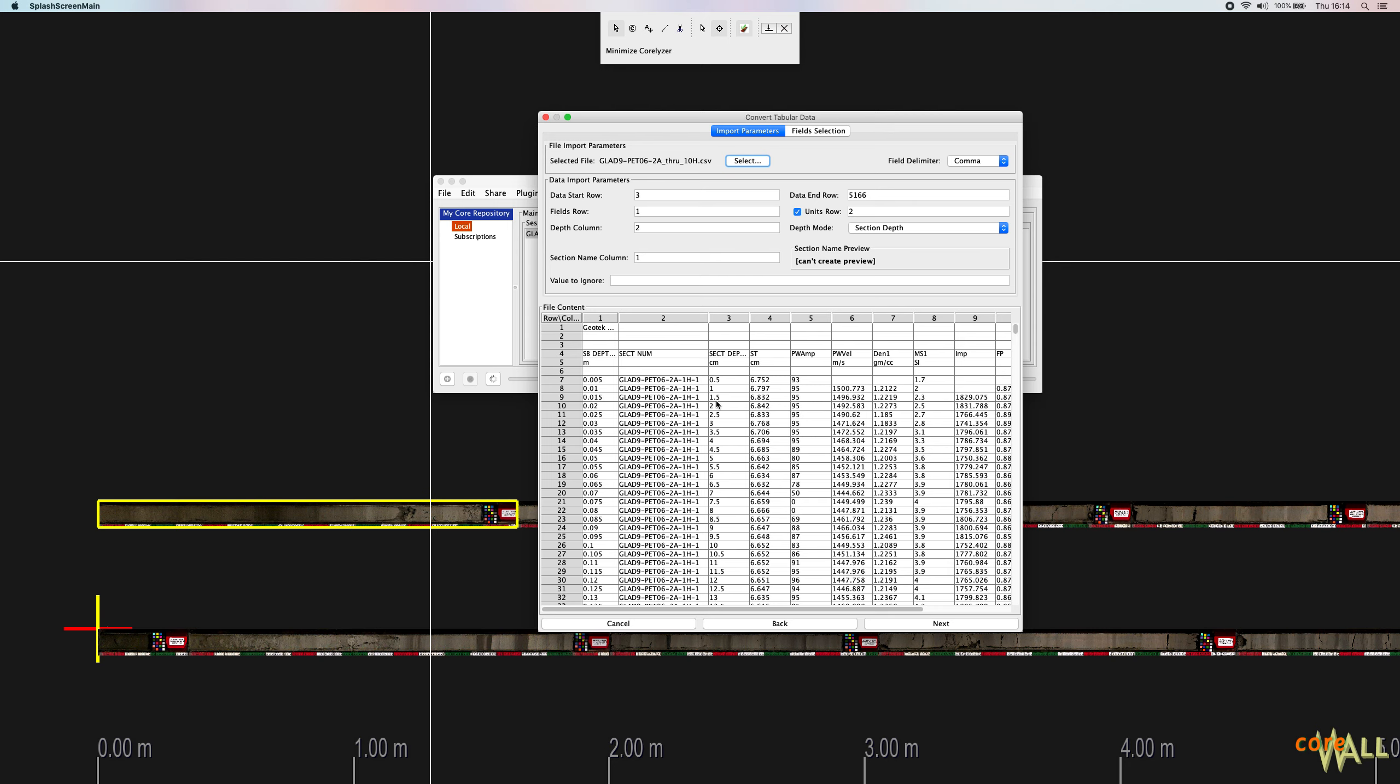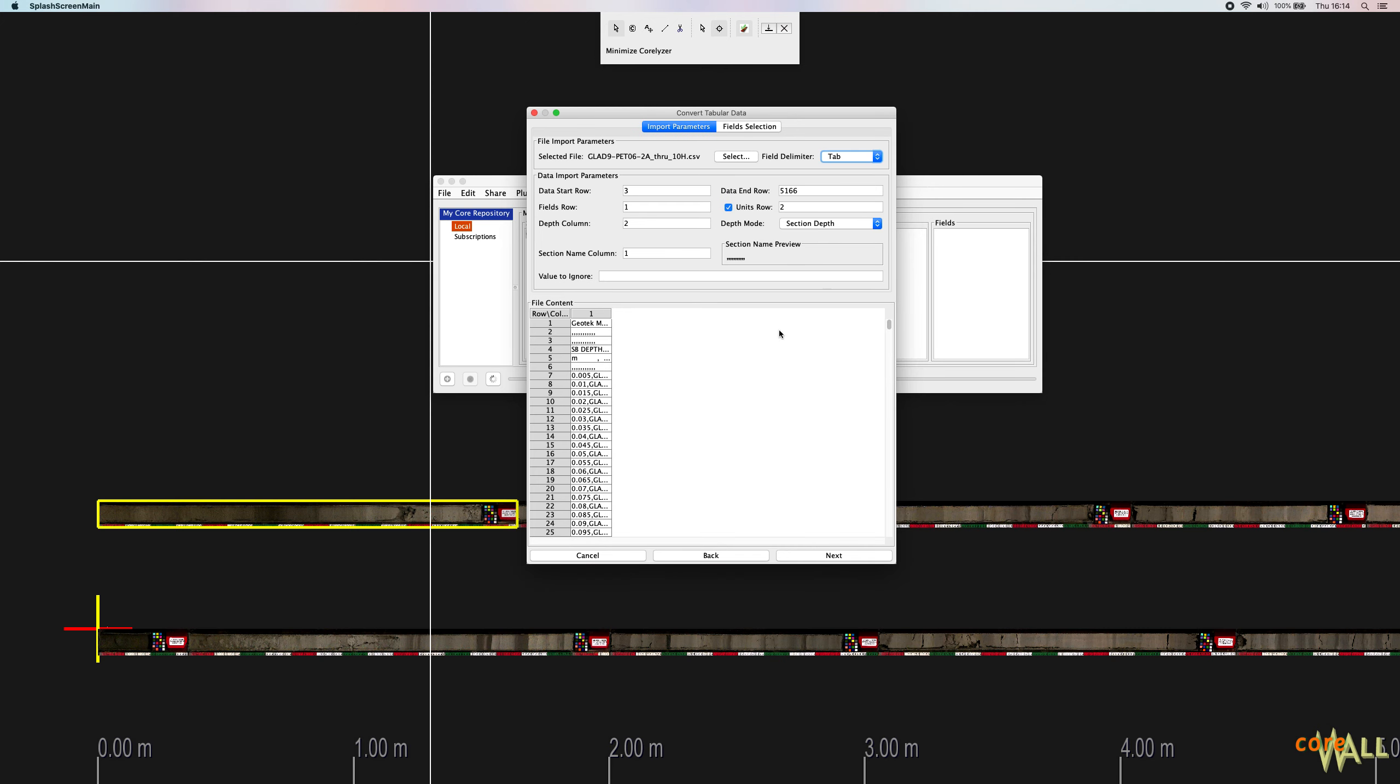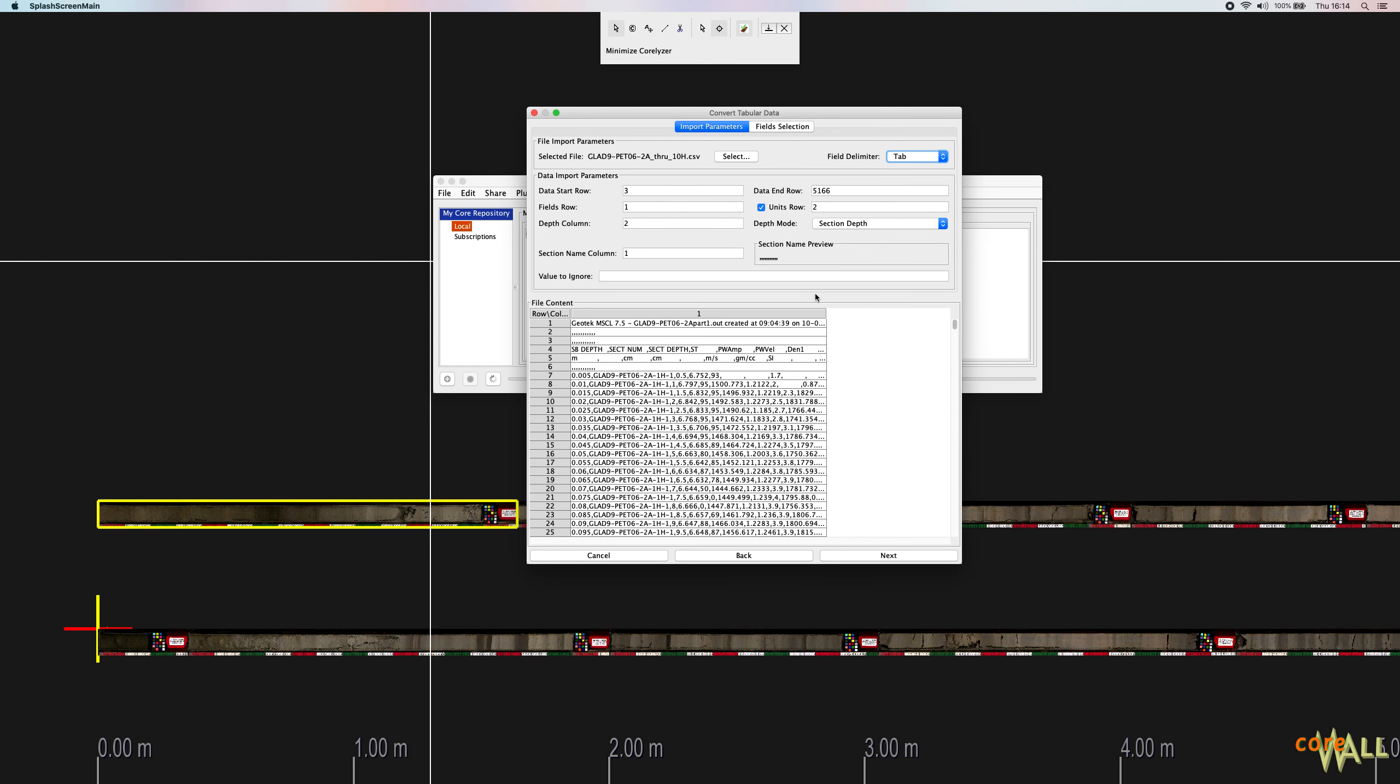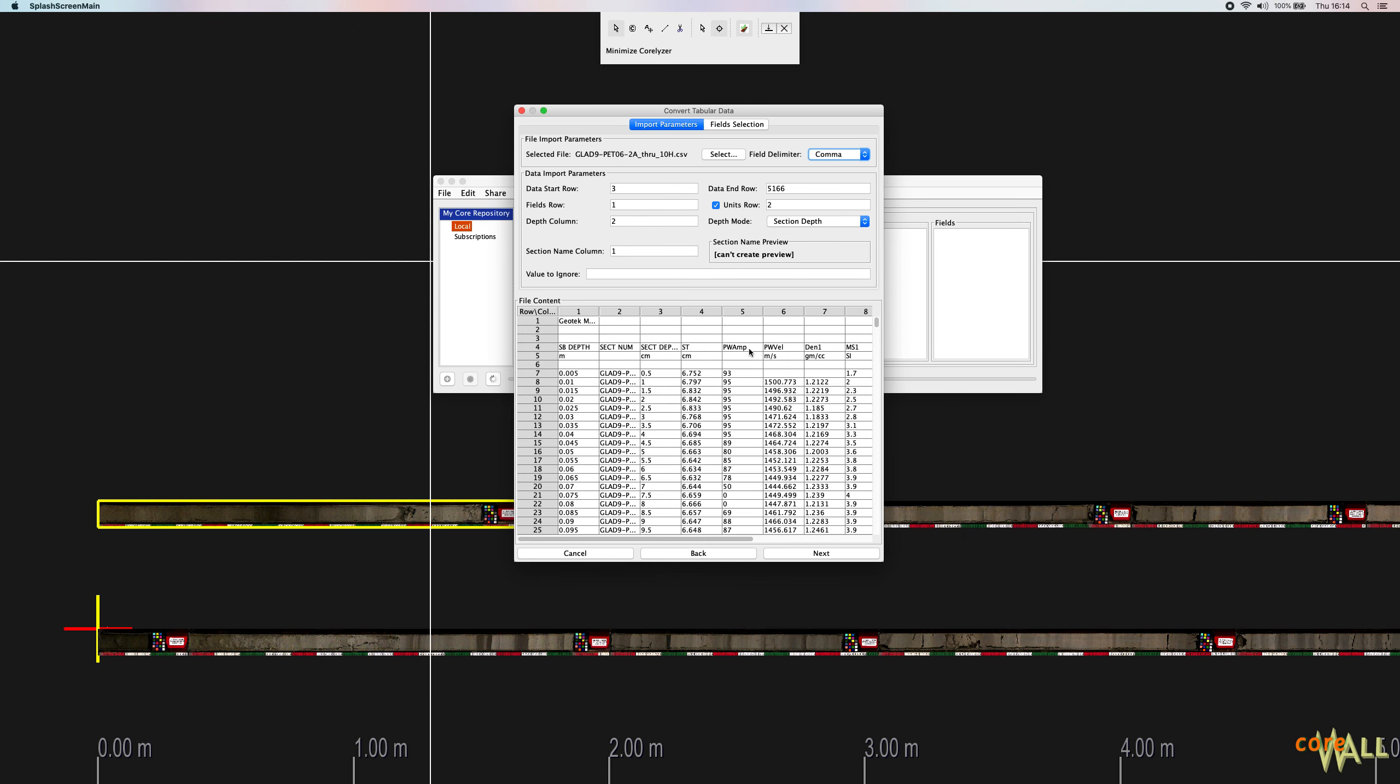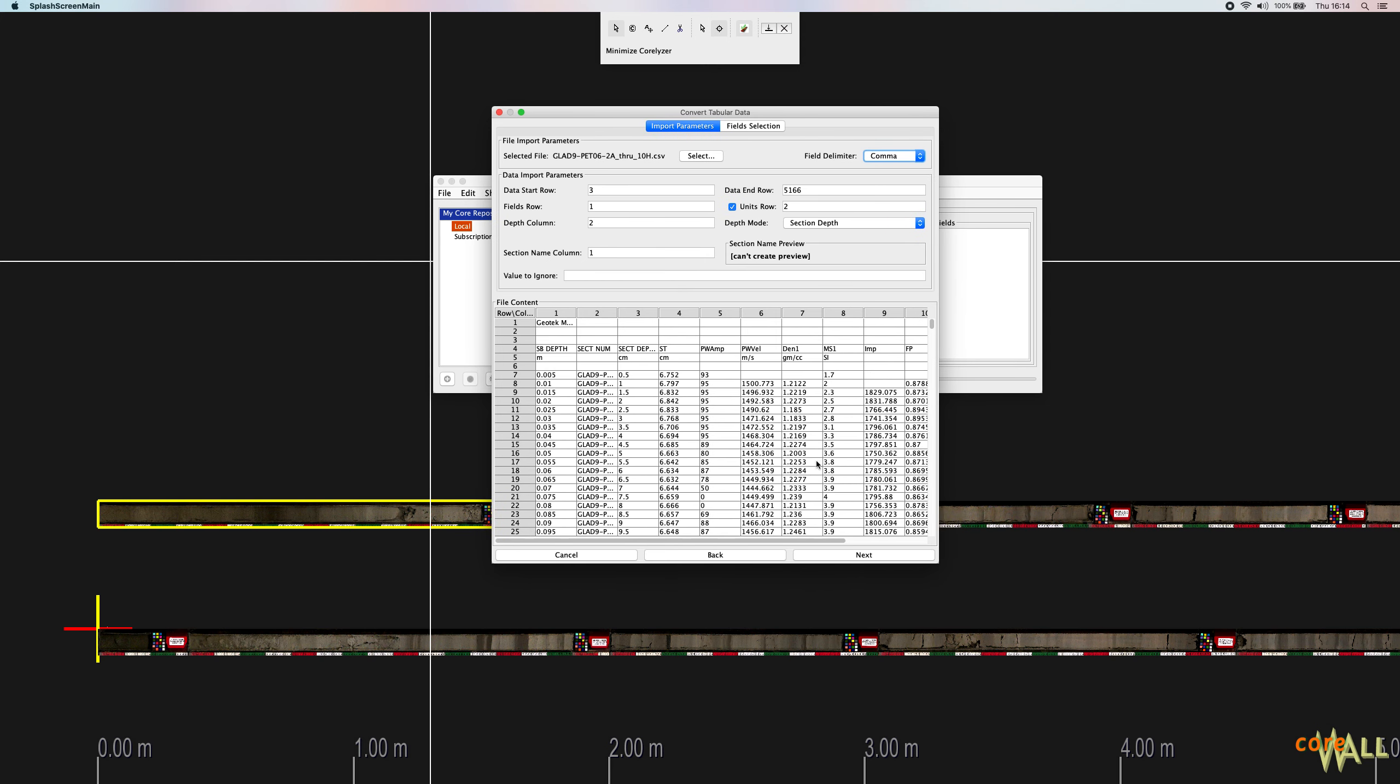The dialog will try to determine the correct delimiter - comma, tab, space, or semicolon for the file, but it doesn't always work perfectly. If you see all your data packed into the first column, that usually means the dialog got it wrong. So just as an example, I'll change my field delimiter from comma, which is correct, to tab. And as you can see, now I have a single column with all of my values. You can fix this by just choosing the correct delimiter here. So I'm going to go back to comma, and we'll happily process it back into the correct format.